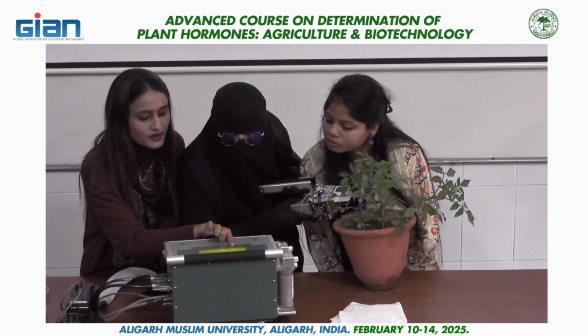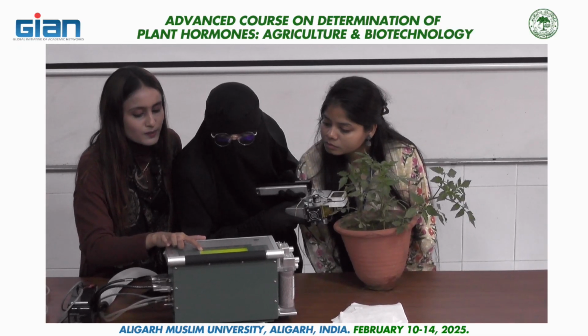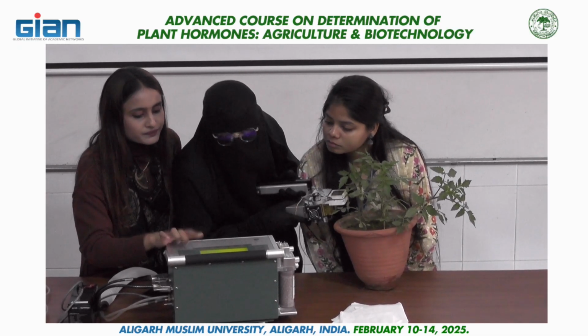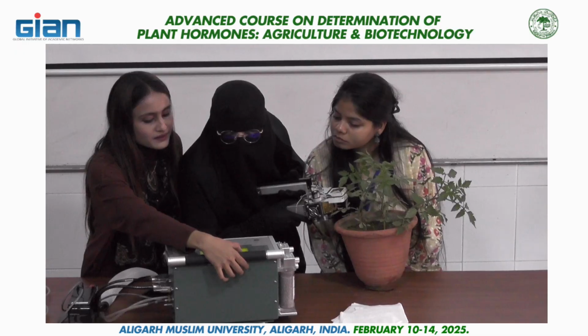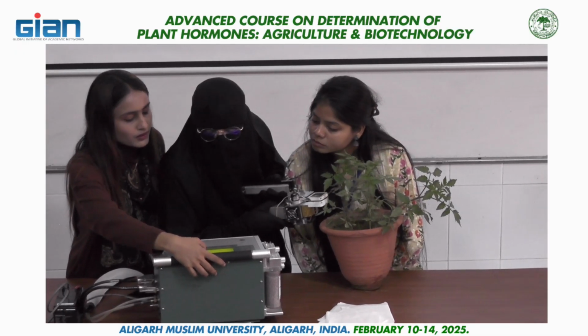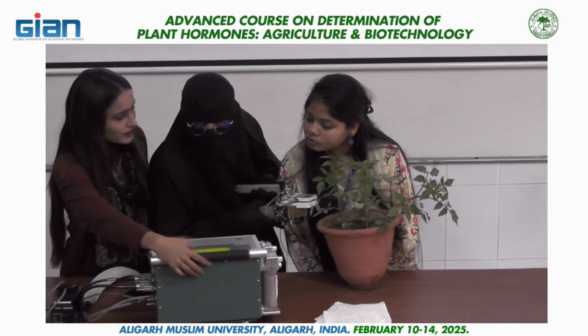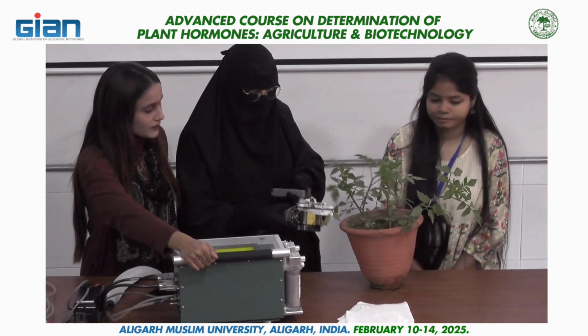This one is photosynthesis. This one is internal CO2 concentration. This one is transpiration rate. Fine. This one is CO2 of reference. This one is CO2 of sample. H2O of reference. H2O of sample. Fine. Clear?